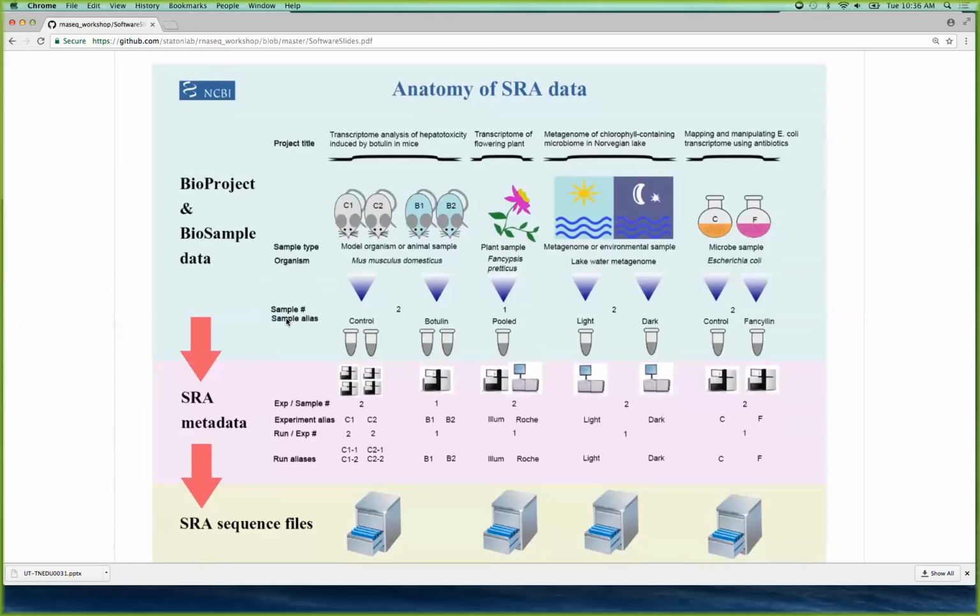And there you're going to describe your cultivars, your strains, if they were grown under some conditions of temperature, also if you have cell lines. So you have to be as descriptive as you can with your samples.